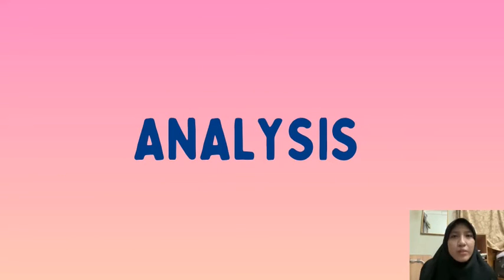Hi, my name is Nurul Hanani binti Abdul Hadi and I will be explaining the analysis part.